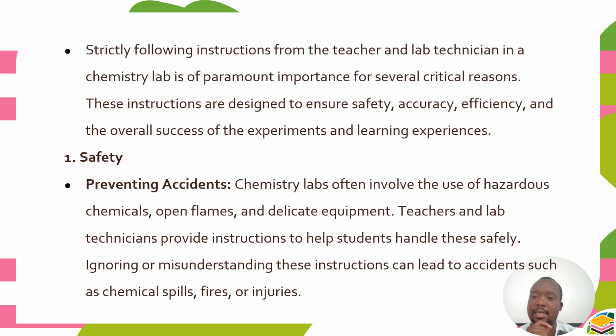So laboratory safety is very, very important because our main aim is to have hands-on experience and conduct research in the lab and not get injured. So if you follow instructions, it is very important. It is for your own safety. So safety, because it will ensure that accidents are prevented.